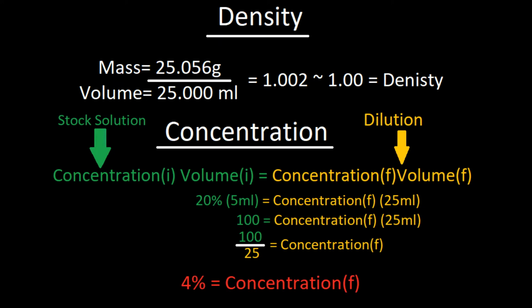Here you see the dilution equation relates the original solution we were given, or the stock solution, to the dilution we just made by proportions with respect to the volume. Here we get a 4% concentration.